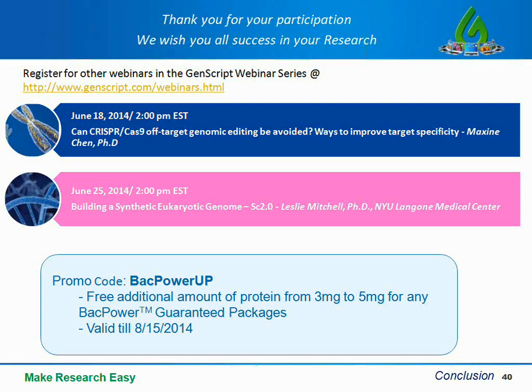Question, I induce my protein when the OD of the bacteria culture is between 0.5 to 0.6. In case the OD reaches between 0.9 to 1, is it still worth inducing the culture? Yes. In fact, for some cases, induction at higher OD can be better when you have enough energy sources. Sometimes for isotope-labeled proteins, induction at higher OD can be very helpful.